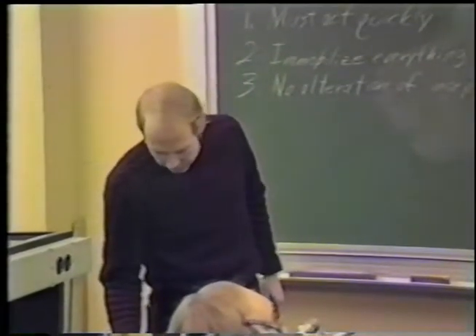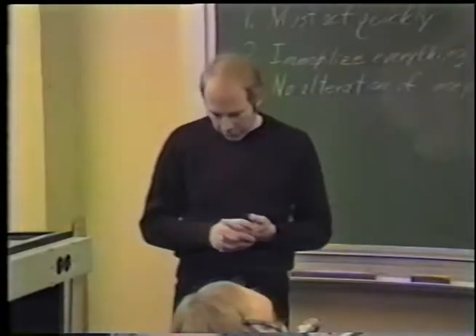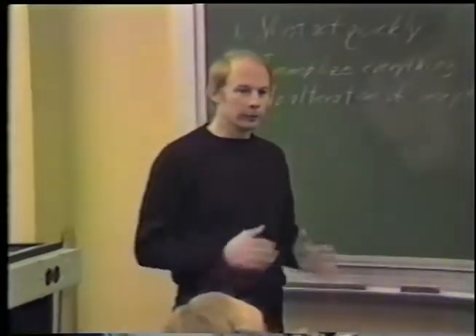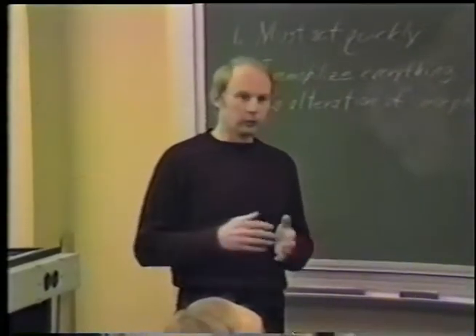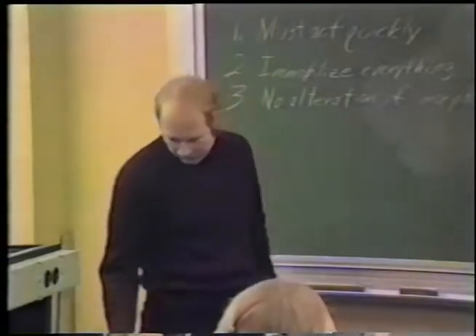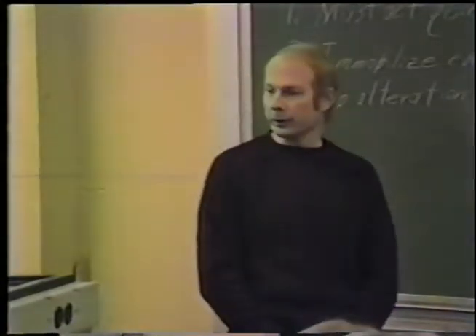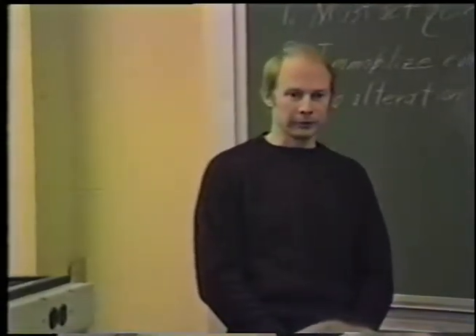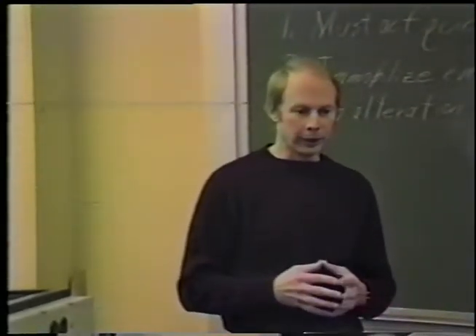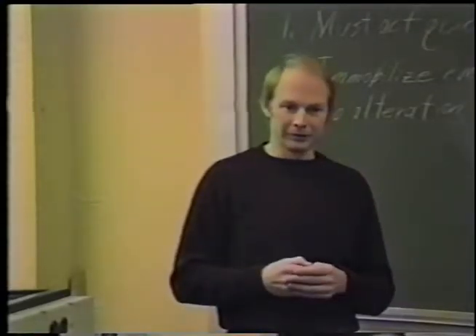Okay. As an example of this, direct light microscopic observations have shown that Haemanthus chromosomes during division can move as much as half a micron while fixation is taking place. Division is not a particularly fast process. It's been shown that in systems that exhibit vigorous cytoplasmic streaming, 100 microns per second, inclusions may be separated by many microns while fixation is taking place.